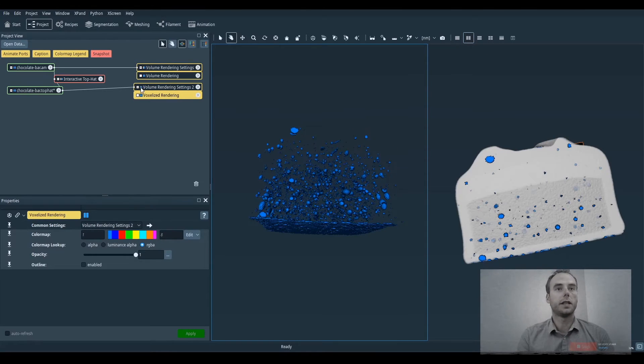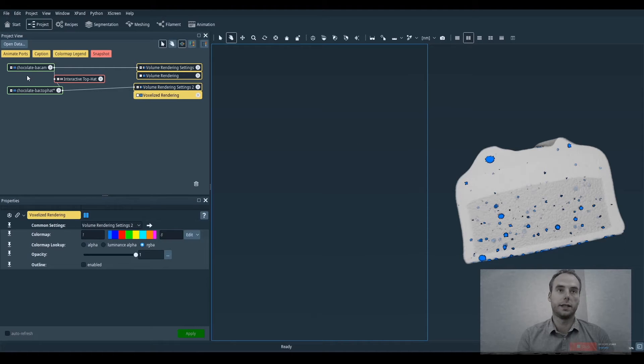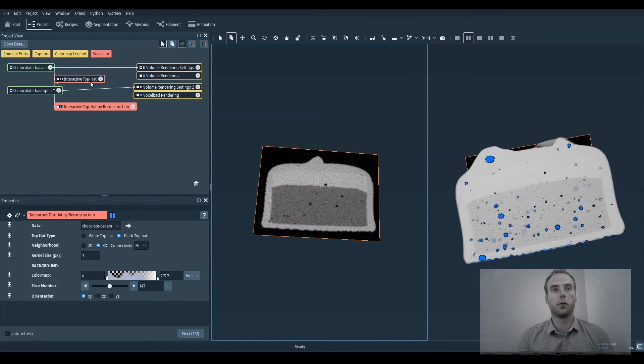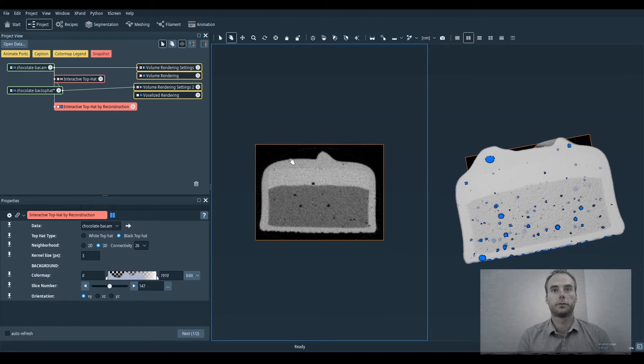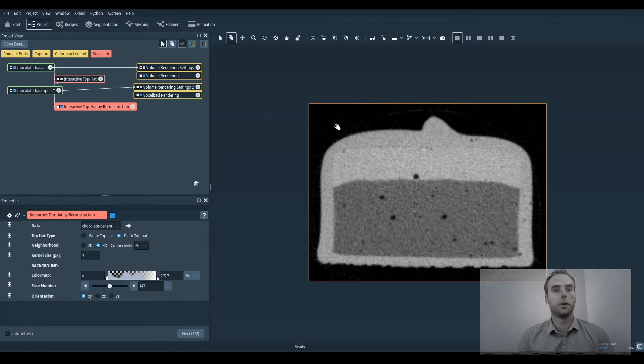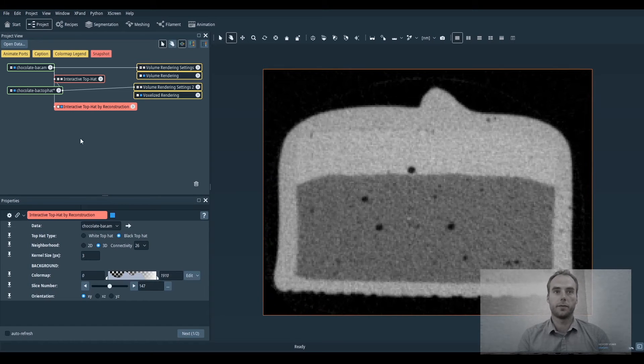This is exactly the same module except it works differently inside because it uses a grayscale reconstruction. But the steps of the module remain exactly the same.